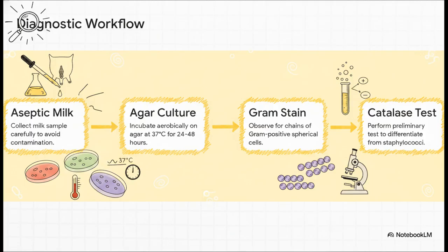Moving to part 2, gathering microbial clues and where the forensic funnel begins. Once we're in the lab, we take that raw evidence and basically pass it through a forensic funnel. We're shrinking the pool of suspects with every single test we run. First up, we immediately culture that aseptic milk. To coax these delicate little organisms to grow, we streak the sample onto specific media, usually blood agar, Edwards medium, or MacConkey agar, and incubate it aerobically at exactly 37 degrees Celsius.